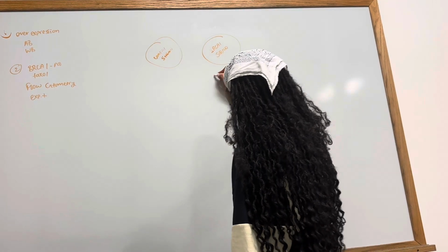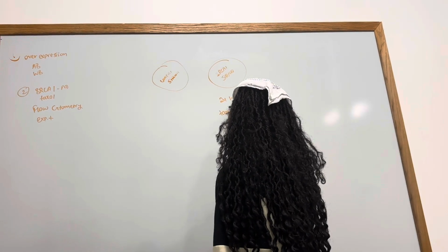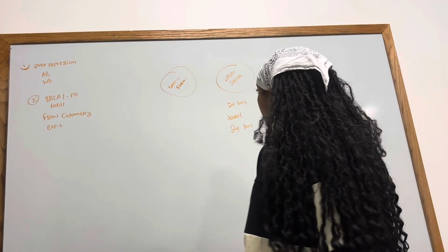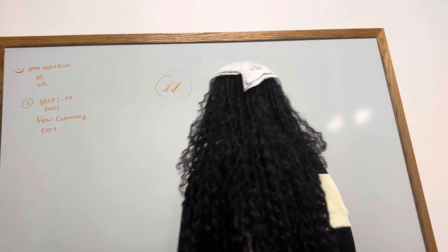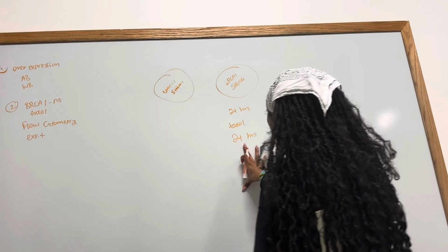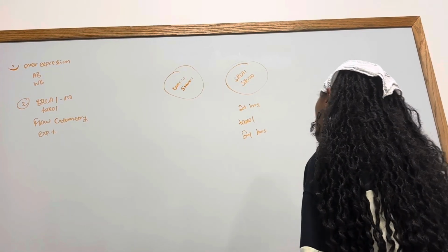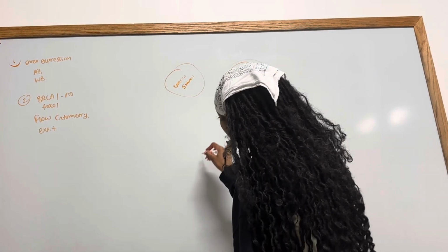So after we do that, we're gonna wait 24 hours, and then we're gonna treat the cells with Taxol, and then wait another 24 hours. After this, to do the flow cytometry, basically, we're gonna permeabilize the cells first, and then we're gonna stain the DNA. How do we do that? Yeah, we use propidium iodide. We stain the DNA. After that, we can do the flow cytometry.